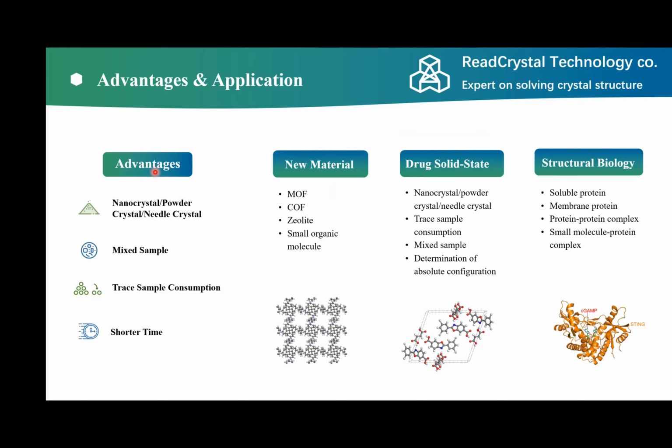So the advantage of micro-ED is that we can solve crystal structures from nano-sized crystals, powder crystals, and needle-like crystals, and we can even solve nanocrystals from a mixed phase sample.